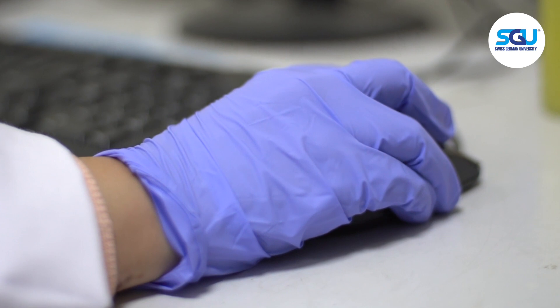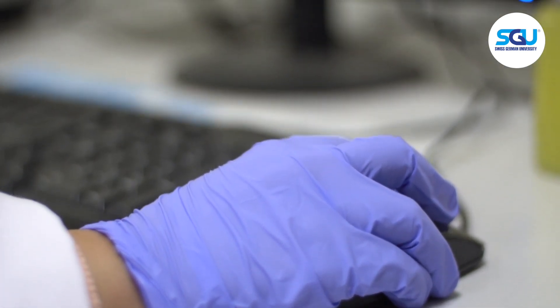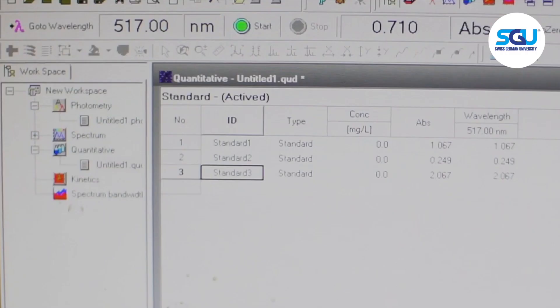In the instrument, color intensity is indicated by the absorbance value. This is the result. Standard 1 is fruit juice with an absorbance of 1.067. Standard 2 is commercial vitamin C drink with an absorbance of 0.249. Standard 3 is the control DPPH with an absorbance of 2.067.